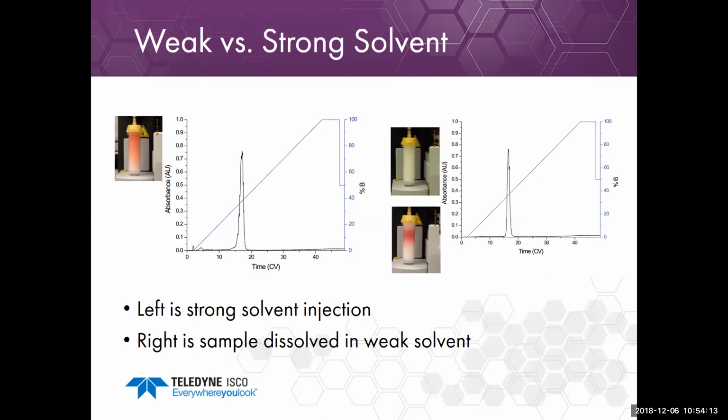Another possibility is instead of using acetonitrile, use acetone or THF, which are both somewhat stronger solvents than acetonitrile on C18. And the third thing that I might try is using the non-aqueous reverse phase. We have a couple of examples up on our website. Yes, they are flash chromatography, but remember they're very similar, where I used non-aqueous reverse phase to purify very hydrophobic compounds off of C18. The fact that it's charged still suggests that you just might need a modifier even so, and if you need a solvent modifier, you still might be working with some degree of water.